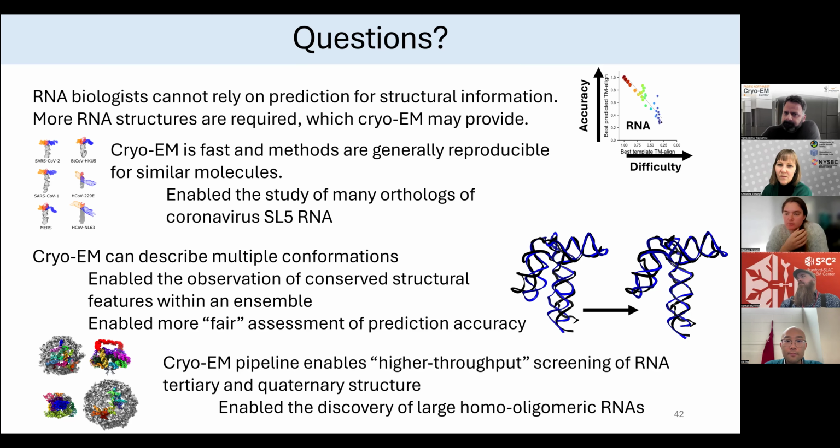The difference between a U and a C is much harder to see. That is probably going to be closer to 1.4, but we're simply not at that resolution of RNA-only cryo-EM to do that. But the difference between a pyrimidine and purine, you can see very early on, often at something like 3.8 angstroms. So just based on that and knowing the exact sequence in your RNA, you can already map out the sequence.